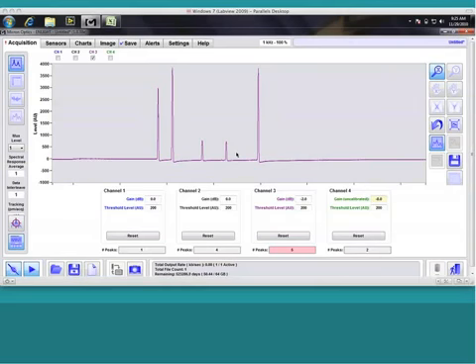So without peak tracking, if you had 3 peaks and one of them disappeared, say number 2, then all of your averaging, distance compensation, and other quantities would be applied incorrectly to the remaining peaks, and all peaks above the failing peak would be inaccurately reported. So let's demonstrate that feature in action.